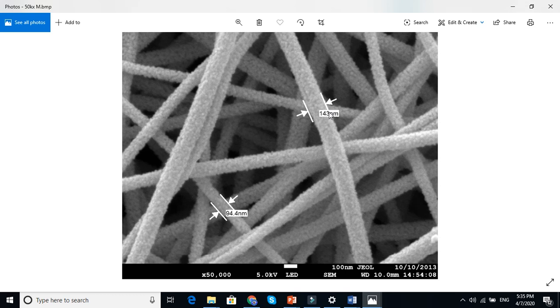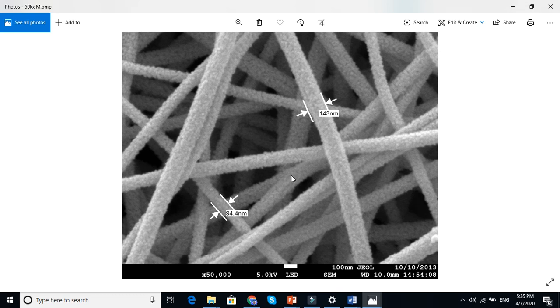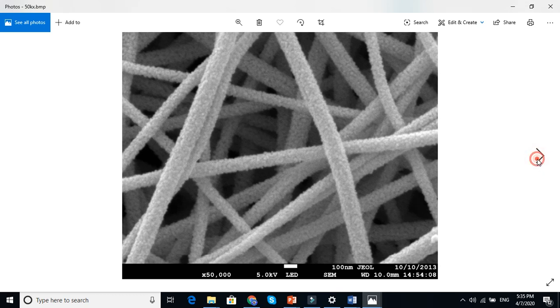And you can see that the surface morphology is rough or smooth, and you can see whether the nanofibers are in condensed form or not in condensed form.